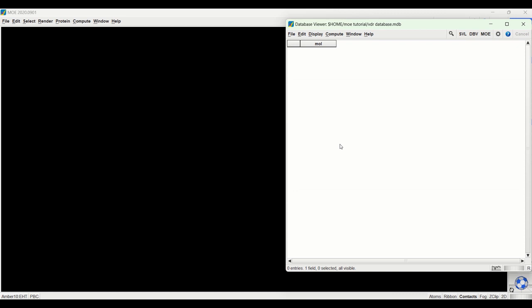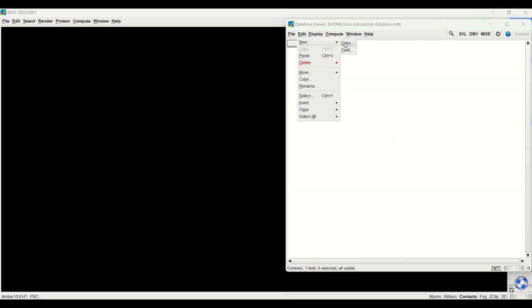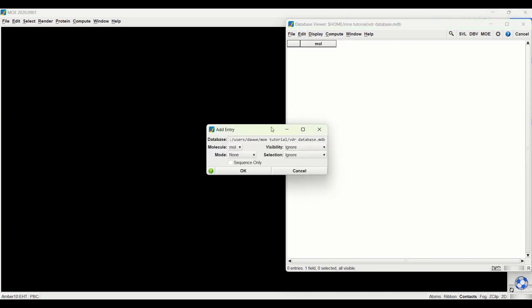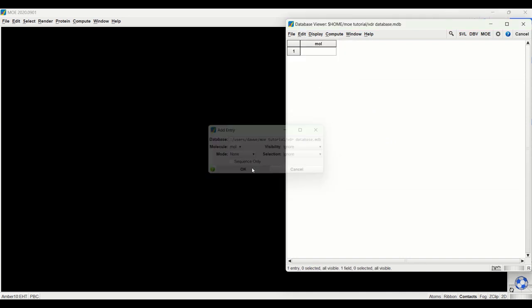And here's what the database looks like. To create a new entry into the database I'd go to Edit > New Entry and click OK. And here it created the new entry in the database where I can then draw molecules that I want to draw.